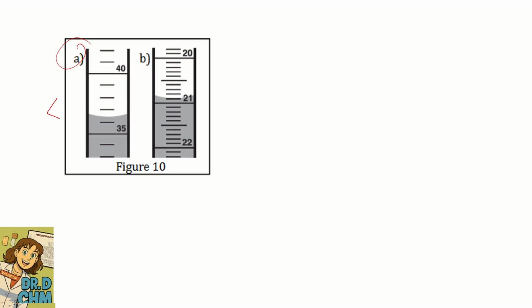First, your eyes must be in the direction of the liquid. Otherwise, you're going to make mistakes and over- or underestimate your volume, okay? So you need to read here, at the meniscus of the liquid, not here on the top that you see it, okay?